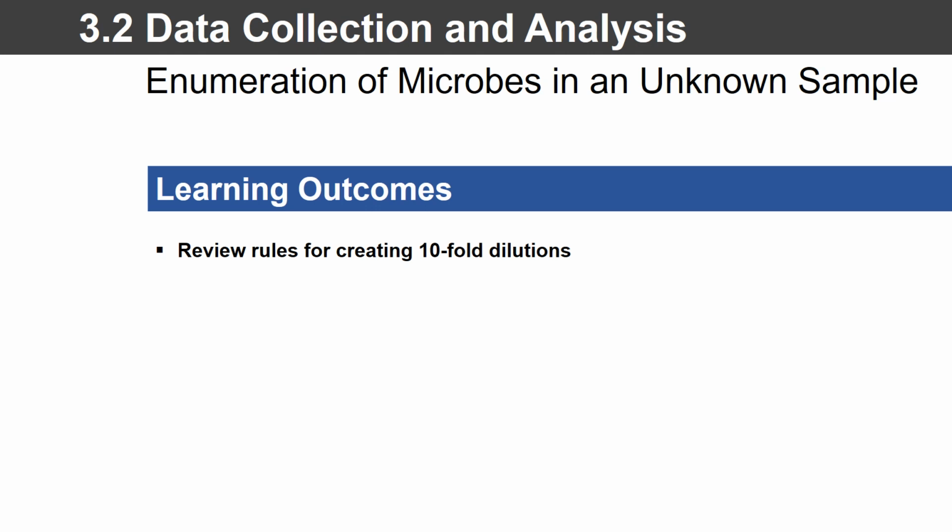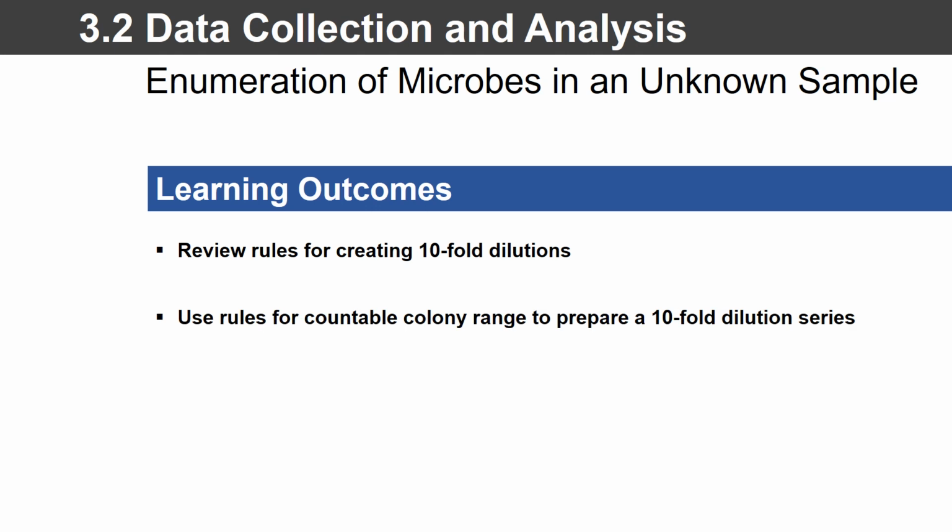First, because we're going to use our powers of 10 and our rules of dilutions, let's go ahead and review those rules. Whether you took Bio 2 here or whether you've transferred in and taken an equivalent, this particular video will catch everybody up and make sure we're all on the same page as we head into class this week and looking forward. The second thing we want to do is review or teach the rules for countable colony range, and then we're going to go ahead and set up a tenfold dilution series.